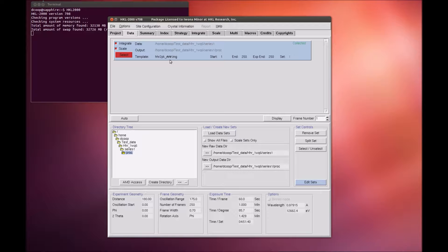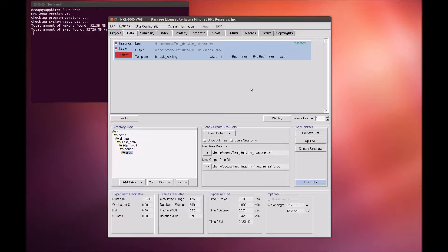Each set of data will appear in a separate box in the data window. Here, we only have one set, but other experiments may have more than one which correspond to different wedges of data or different data collection parameters, such as distance, frame width, wavelength, etc. The parameters for each can be viewed in the Summary tab at the top.